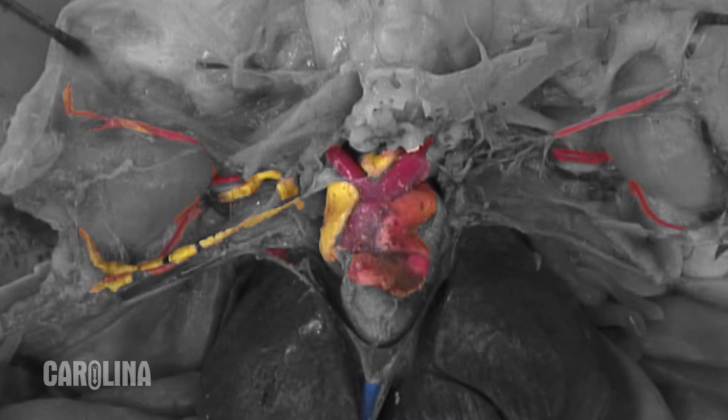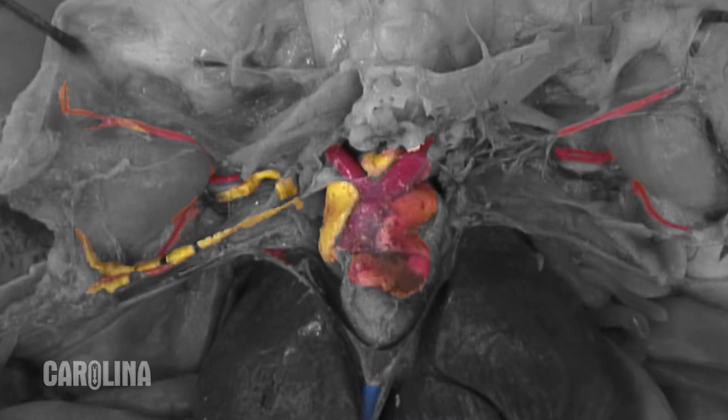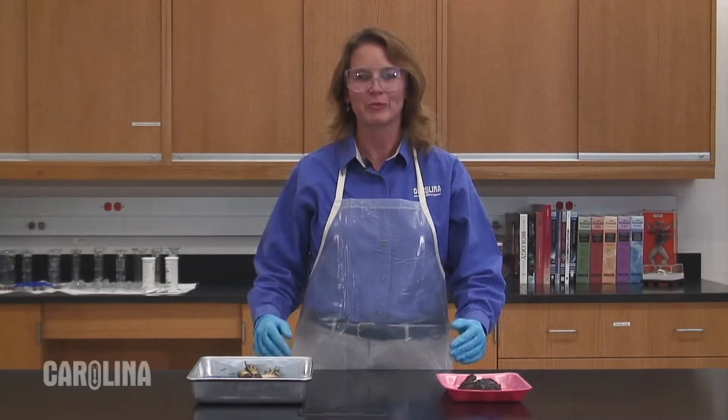Keep in mind that the systems of frogs are injected differently than most other specimens. Once you determine the size and injection type of your frogs, the final decision factor is your budget. As an example, you can order enough plain frogs for your entire classroom and then add an injected frog as a shared visual aid.